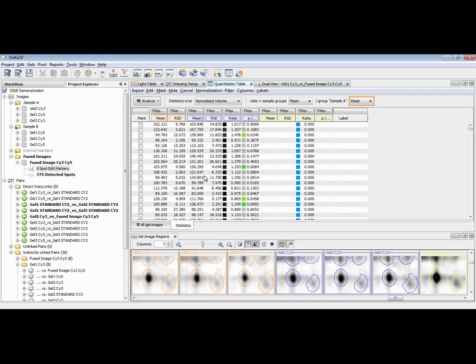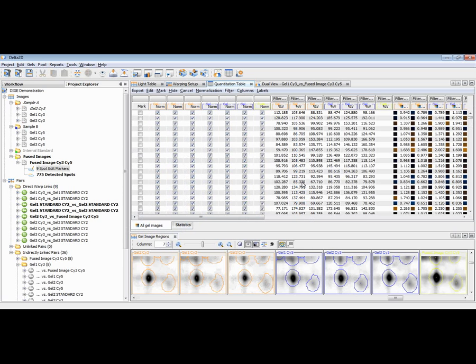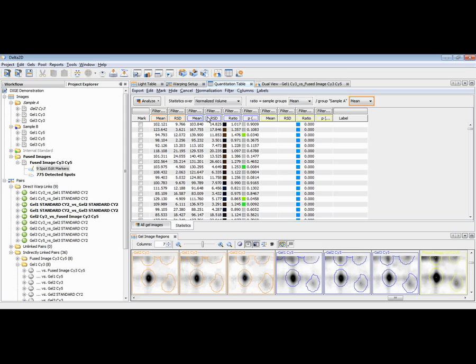The statistics table, of course, is more and more useful when having replicates. You do not want to have a look into the detailed view of single images. More often you will use the means, compare the means. You want to analyze the ratios or p-values, or even use the statistical toolbox by pressing the Analyze button. But this is part of a different webinar where we cover advanced statistics and other things like that. So now we have a lot of tables, a lot of columns, and each column represents a certain attribute for a certain image or group.